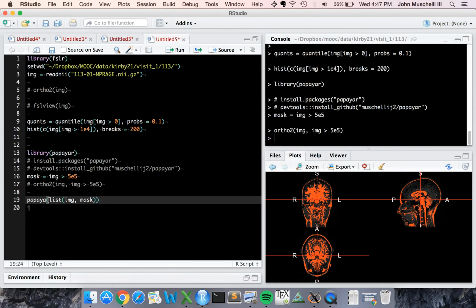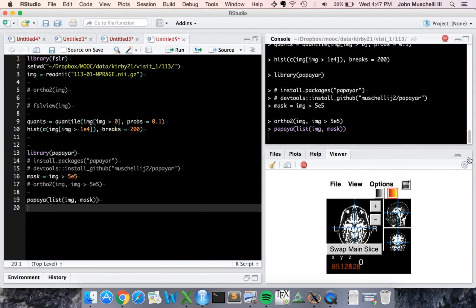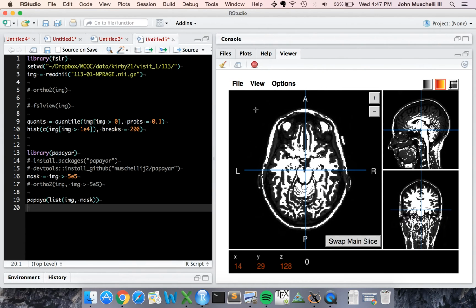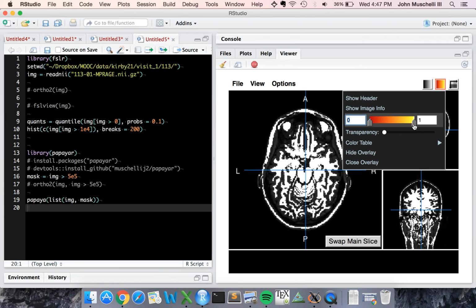So once we do this, we're going to wait a second and it's going to write these out to a specific folder, and then we're going to be able to view these interactively within the RStudio window. Right? So that's what's really nice. You're all within R. Right? It's a little small, but we can make that a lot bigger. And I'll show you how to do this at the command line if you want something to pop up that is a little bit better in your browser.